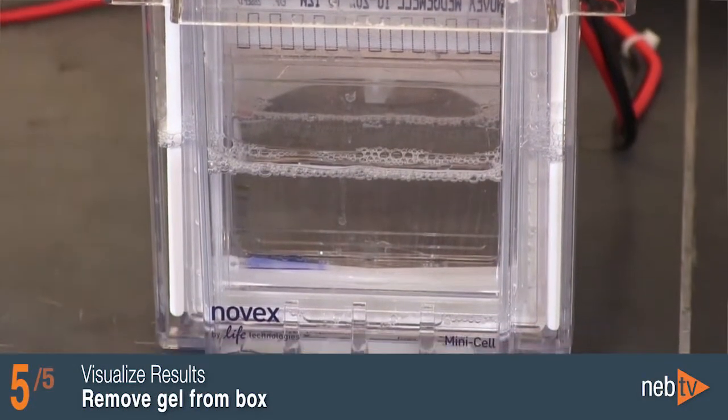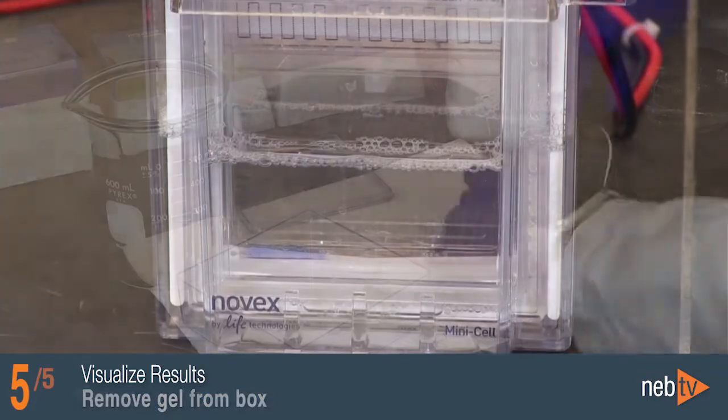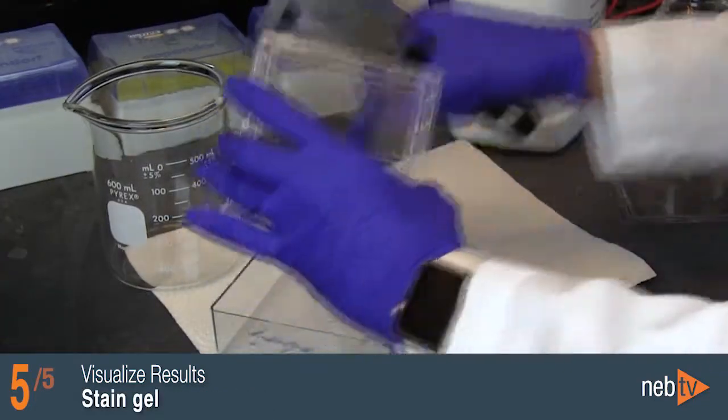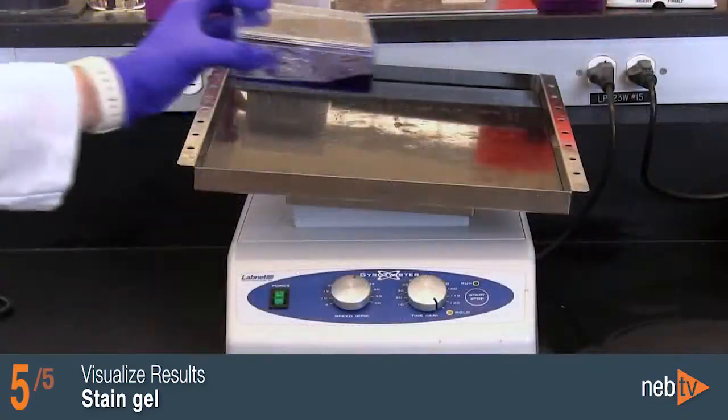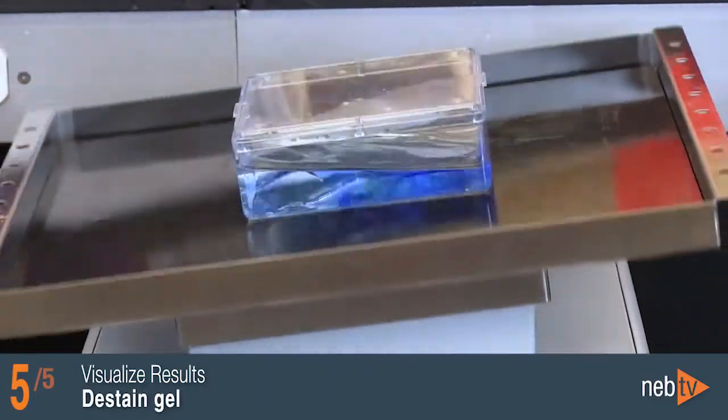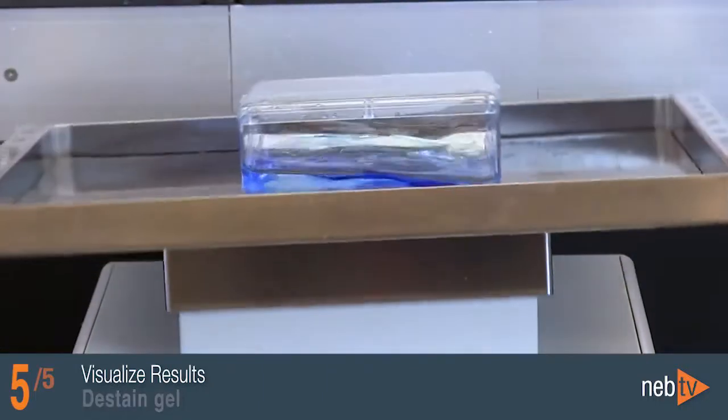Remove the gel from the gel box after the dye has migrated to the bottom. Place the gel in a plastic tray and stain with Simply Blue Stain Solution or any stain of choice, following the manufacturer's protocol. De-stain the gel with water solution following the manufacturer's protocol.